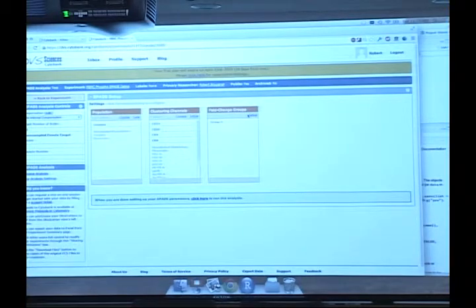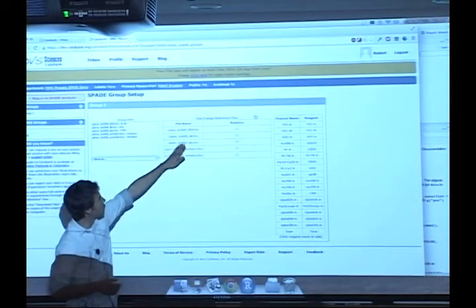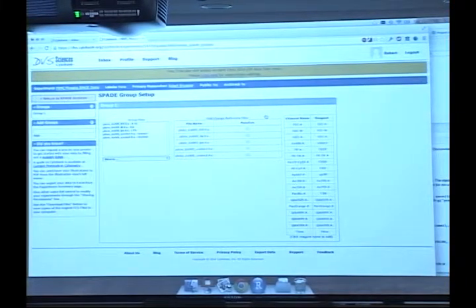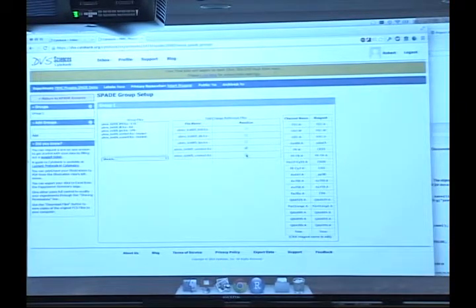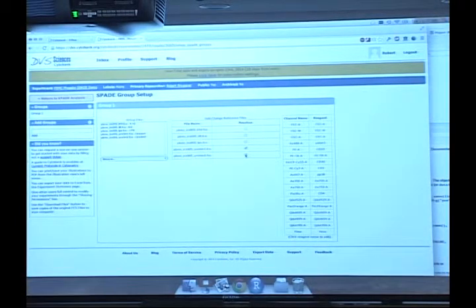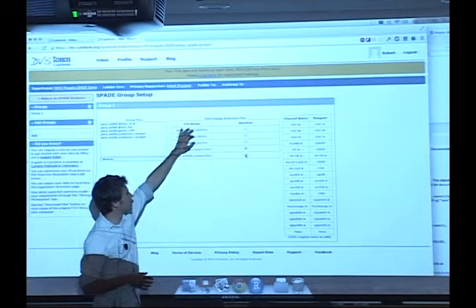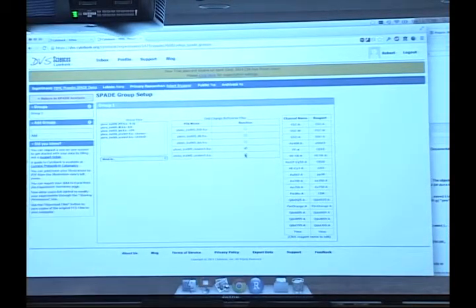The other thing we have to do in this circumstance is, what I would like to do with these data is see the difference in signaling between my unstimulated samples and my stimulated samples. So I'm going to select the different groups for fold change references. It's going to ask me, what are my reference files? What's my basal condition that I'm interested in comparing against? So I'm going to check the 2 unstimulated samples here, because these are the reference conditions that I will want to evaluate signaling in response to. So I'm interested in seeing what the signaling does in these stimulated samples versus these reference samples. So I've selected those.